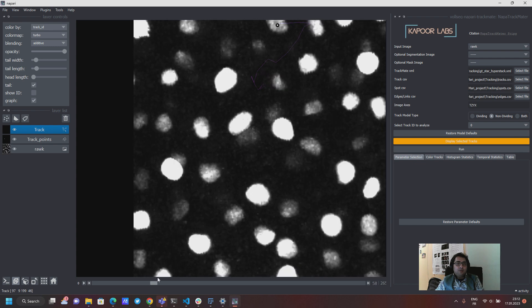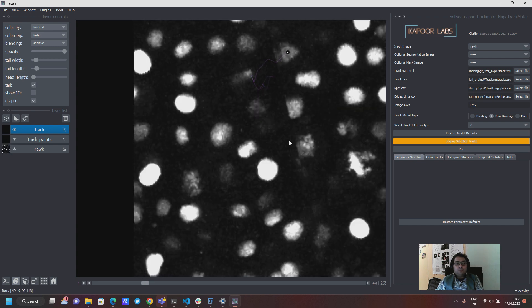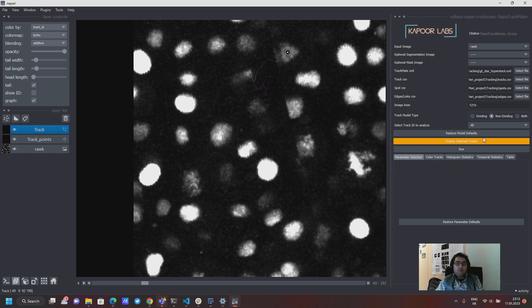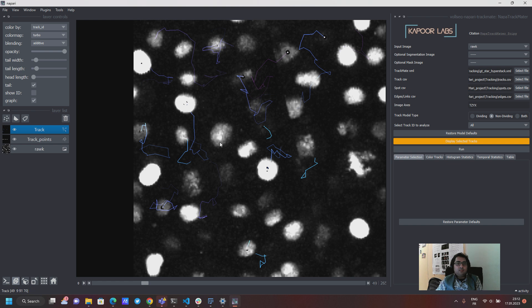And now here's the cool thing. Let me say I want to see all of the non-dividing tracks at once. You hit display selected tracks, give it a time to calculate and display all of these tracks at once and then I will see what happens when I change this color to generation.